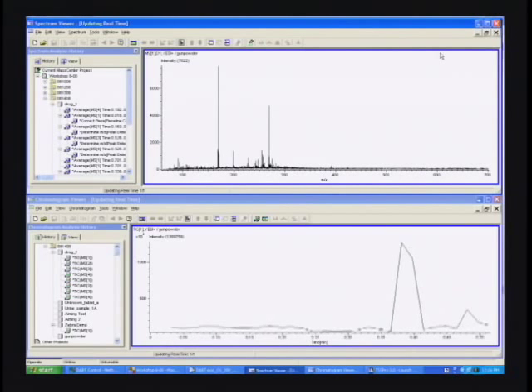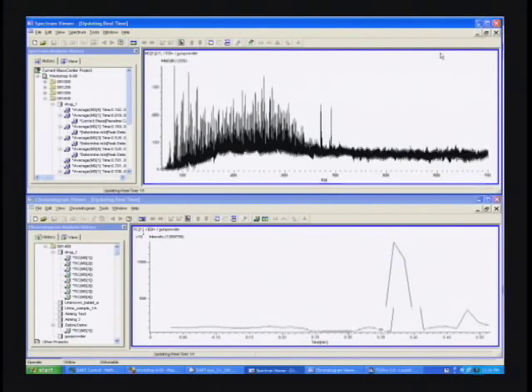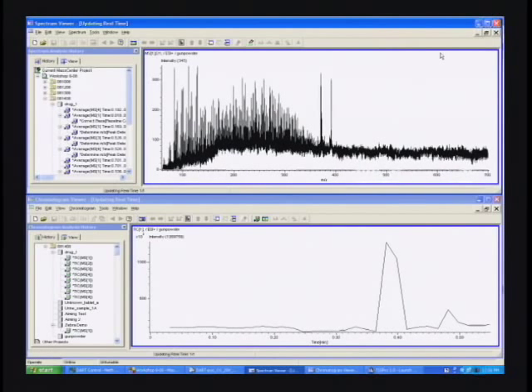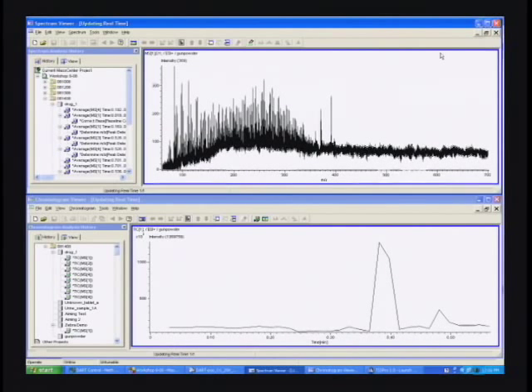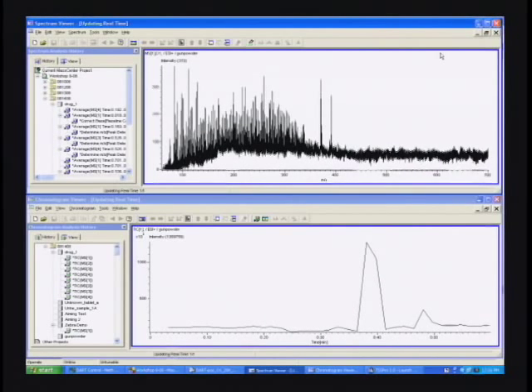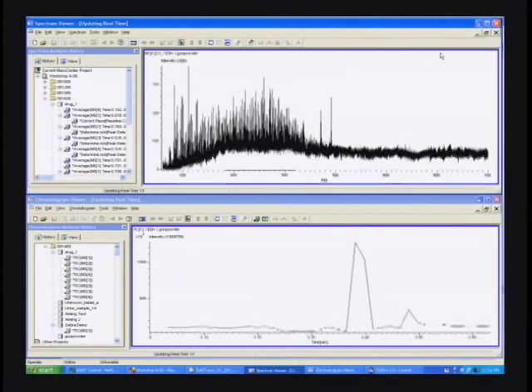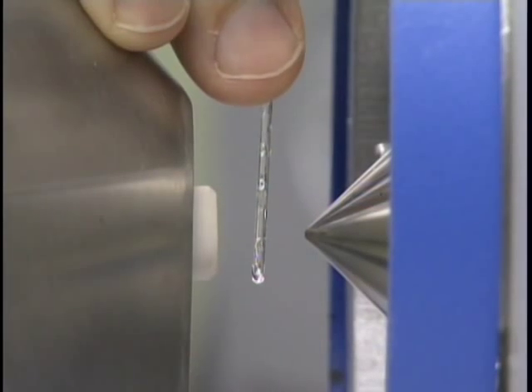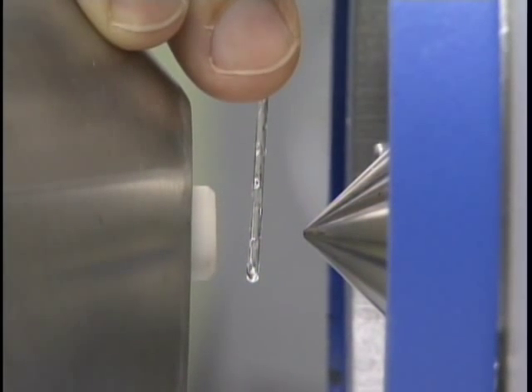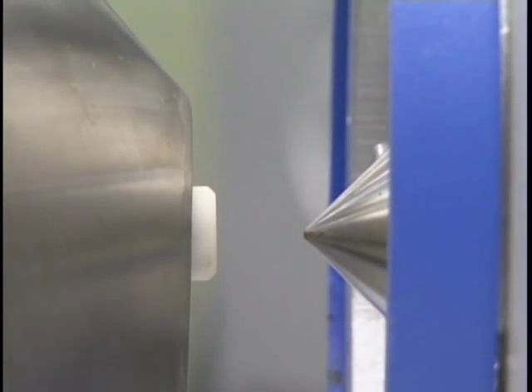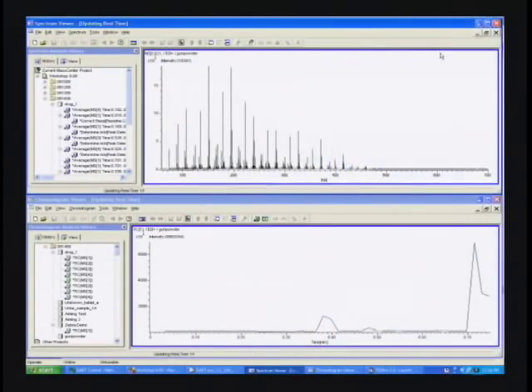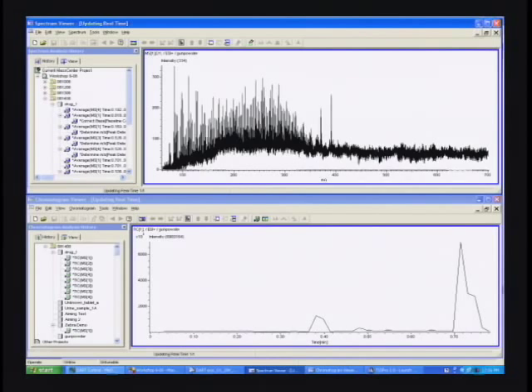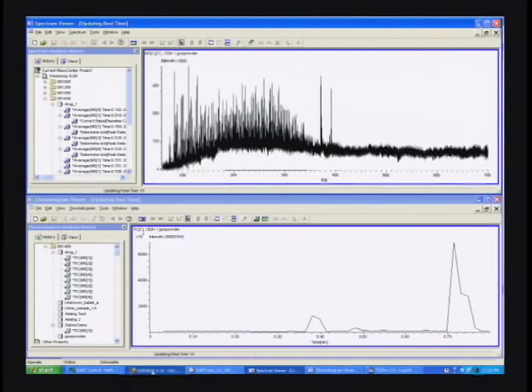We're going to look for additives, stabilizers, burn control agents, anything that makes sense in gunpowder, and go ahead and run our calibration right here. And now we're done. We'll go ahead and close the file and see what it did for us.